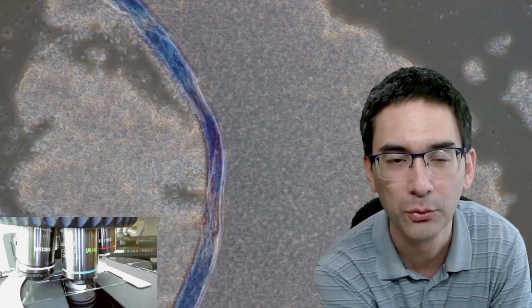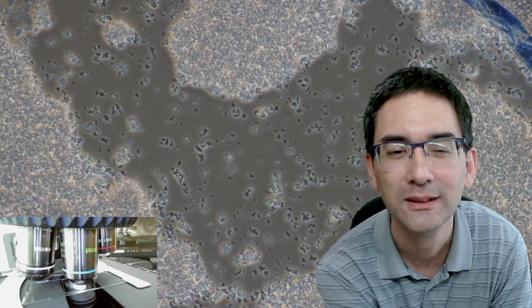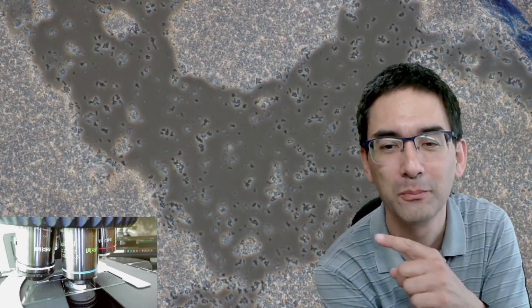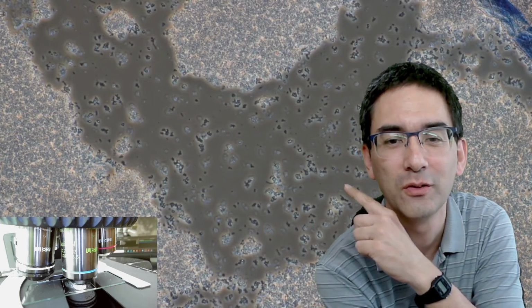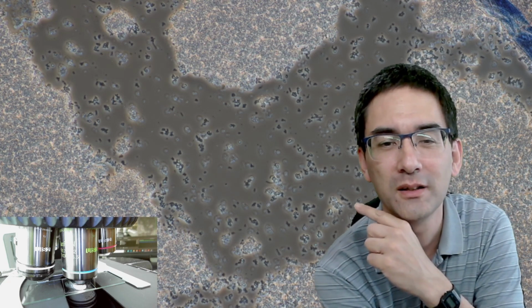Yeah. There are a lot of milk proteins in here. But between here, this blue fiber is huge. But look here carefully when you see this here. Do you see those dots right now in the middle? I'm going to point towards it. Those dots that you see over here. Yeah, all of those tiny, these seem to be bacteria.